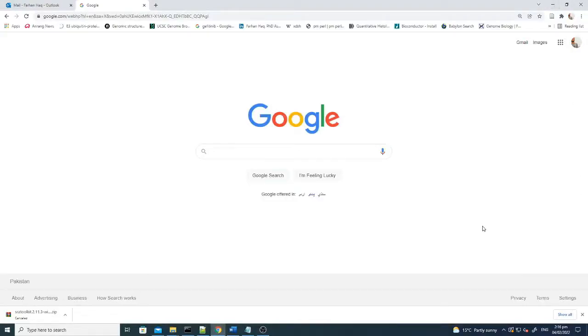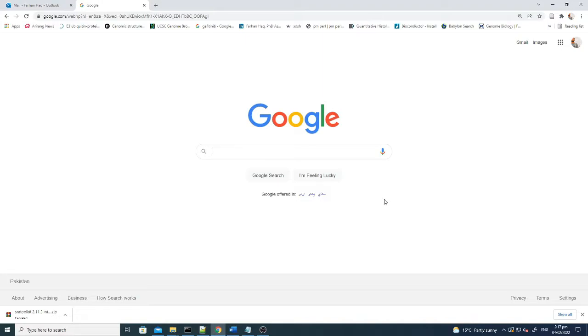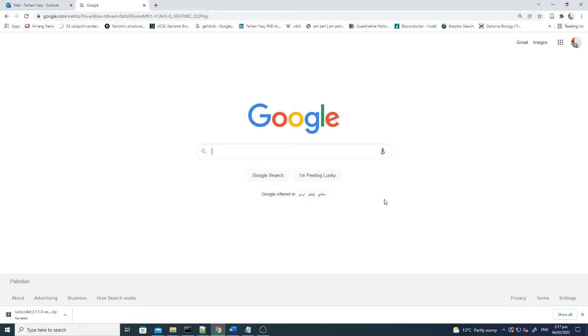Hello everyone, from now on we will start to analyze RNA sequencing or whole genome sequencing data. I will start from the first step one by one, and if you follow all the tutorials I will upload sequentially, by the end it will be easy for you to download and analyze whole genomic sequencing or RNA sequencing data available on the NCBI portal.